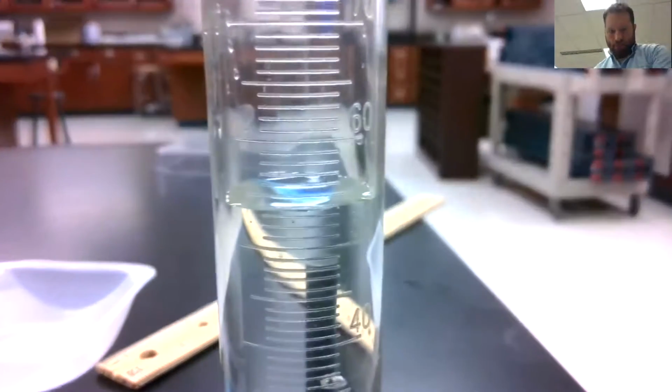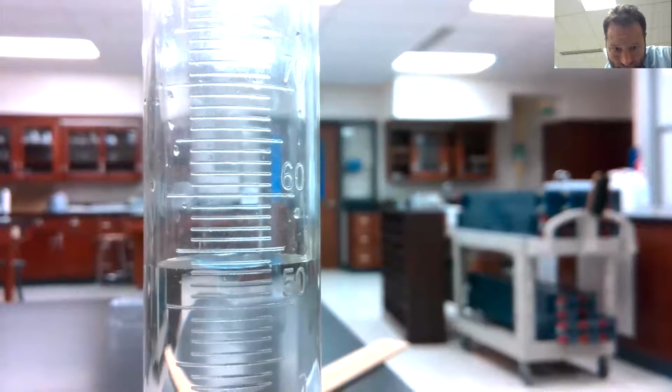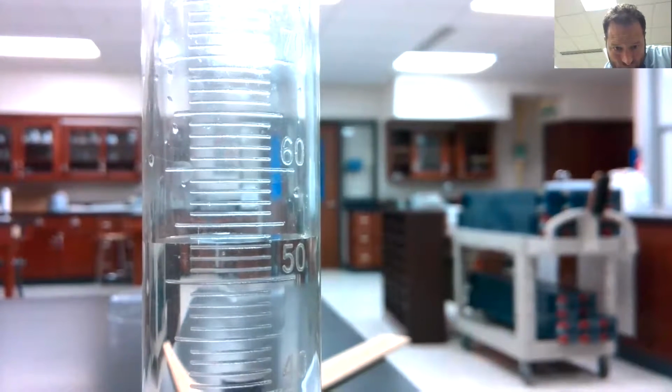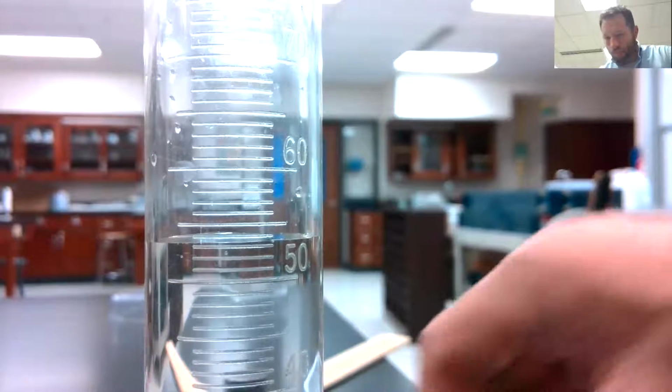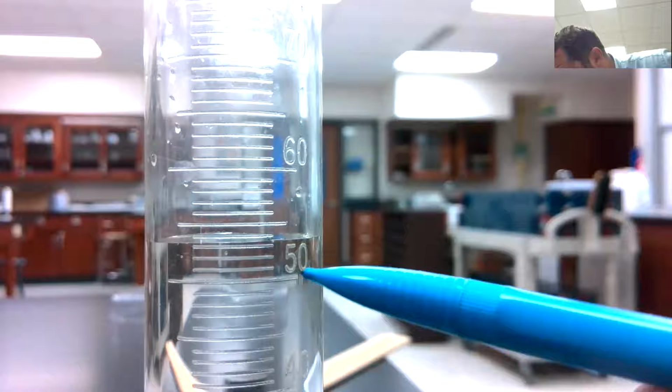I'm going to put some water in it. Okay, so there we go. I don't see much of a meniscus, but always read from the bottom of the meniscus, and that's why we get it eye level. So there we go. Right here, you can see is 50 milliliters.